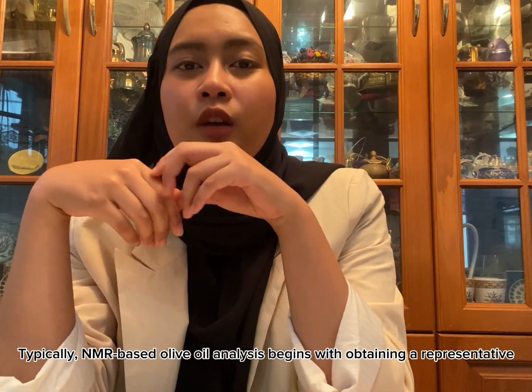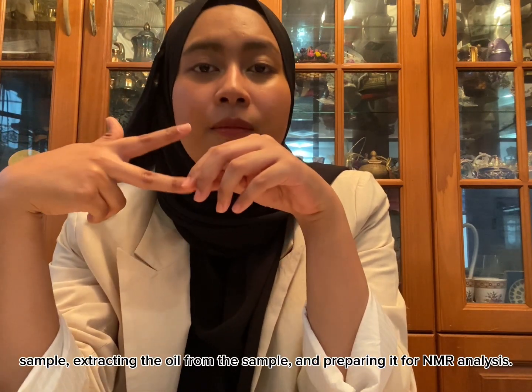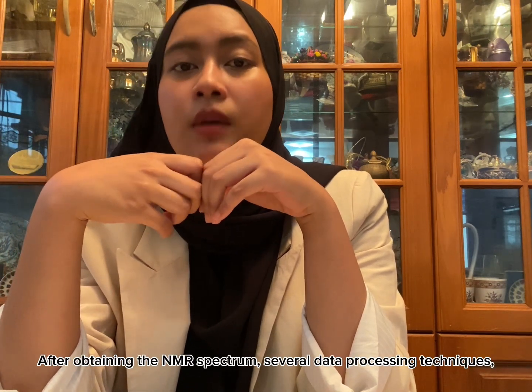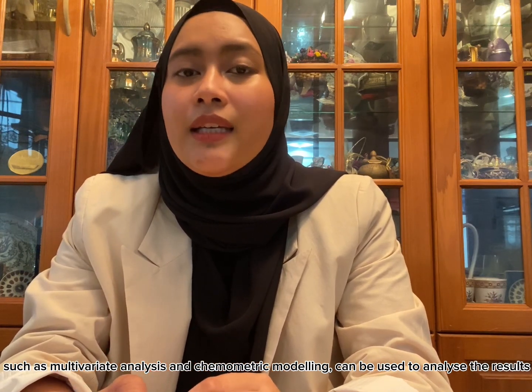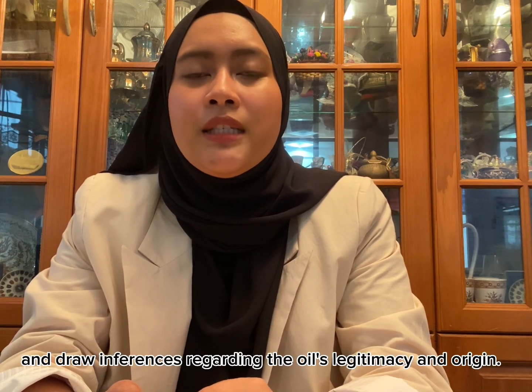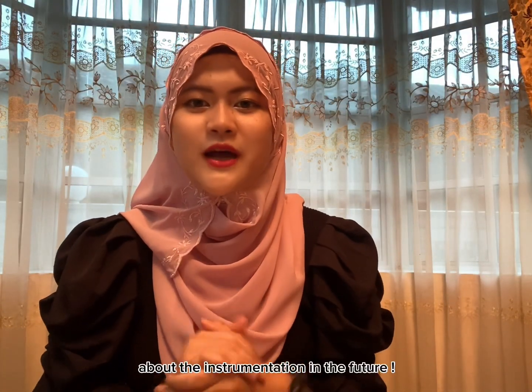Typically, NMR-based olive oil analysis begins with obtaining a representative sample, extracting the oil from the sample, and preparing it for NMR analysis. After obtaining the NMR spectrum, several data processing techniques such as multivariate analysis and chemometric modeling can be used to analyze the result and draw inferences regarding the oil's legitimacy and origin. Thank you for the clear explanation. I hope we can have more conversation about the instrumentation in the future.